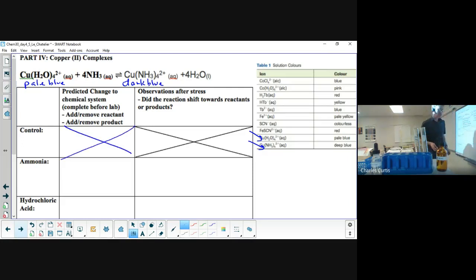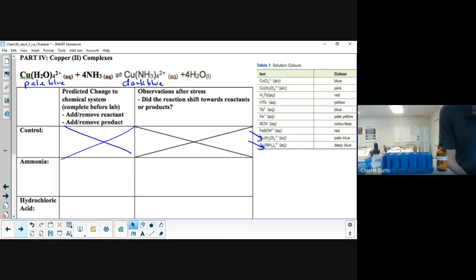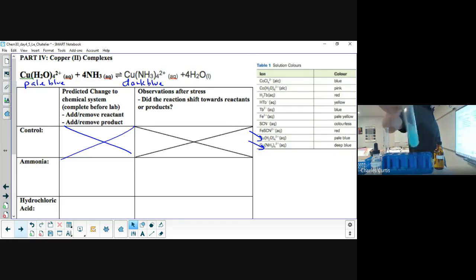Now in this one, we have to make up the equilibrium mixture first. So the control is not these. This is just copper sulfate, and I need to add a couple drops of ammonia to make our equilibrium mixture. So the procedure asks me to put in 3 drops. Okay. Now this has copper and ammonia, and I'm going to shake it, and fairly quickly it's going to go to equilibrium. Okay. So our equilibrium mixture is starting with the paler blue.